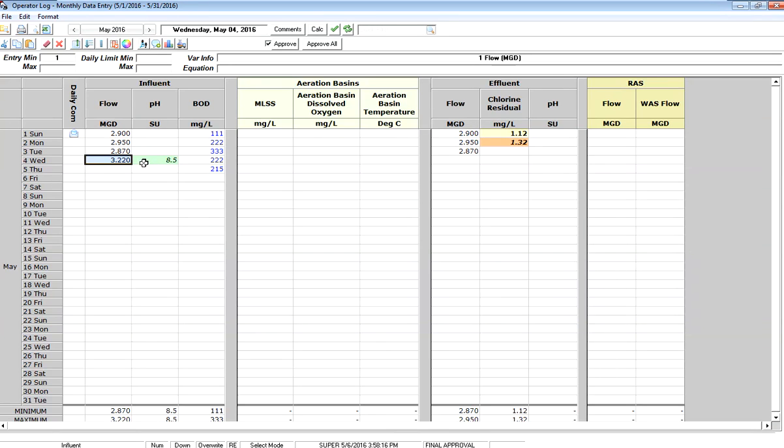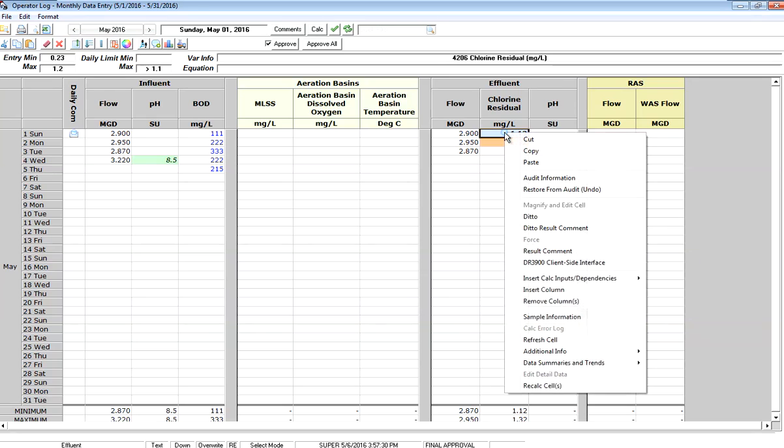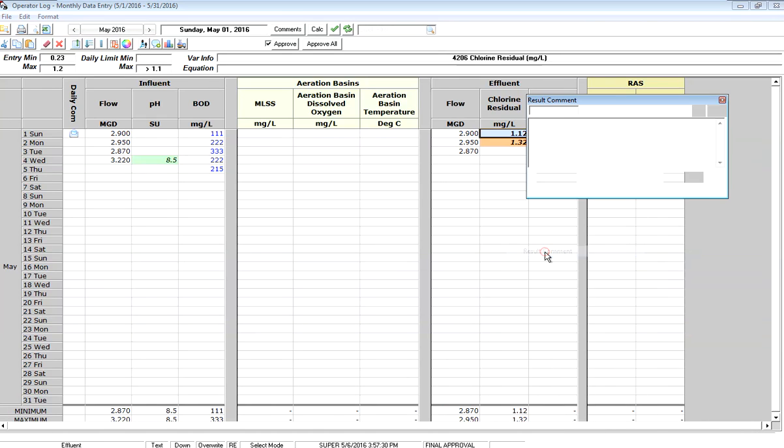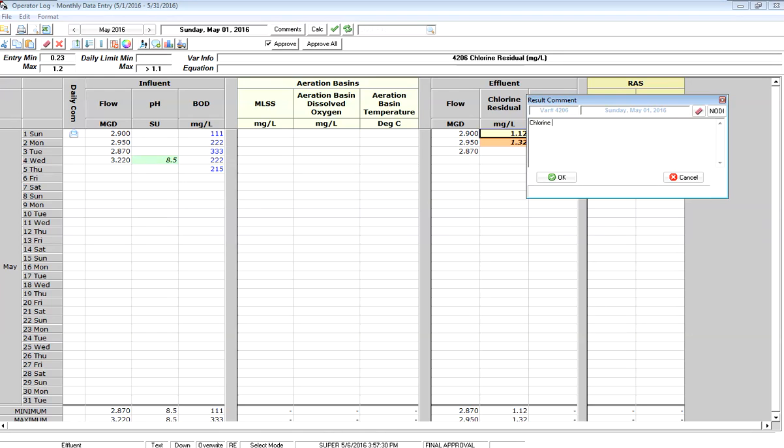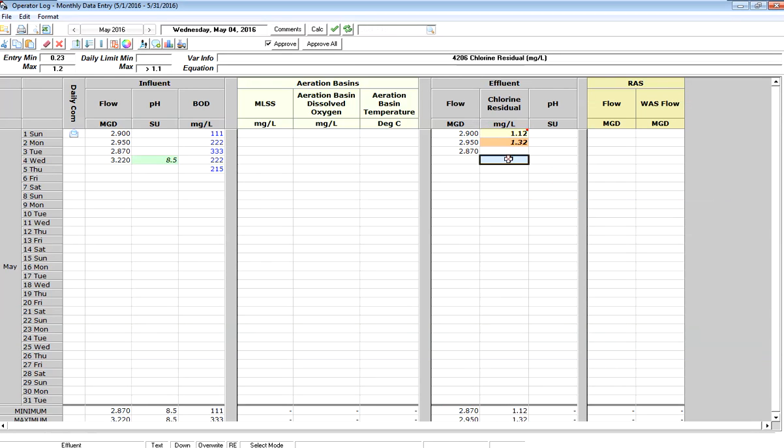I may also want to indicate what's going on with my violation here. So if I click on a cell, I can right-click and get a menu of options, and in this case, I'm going to go to result comment, and I'm going to make a comment that our chlorine is high due to overfeeding. So I can make a comment on the data, and it will put a red dot in the corner.